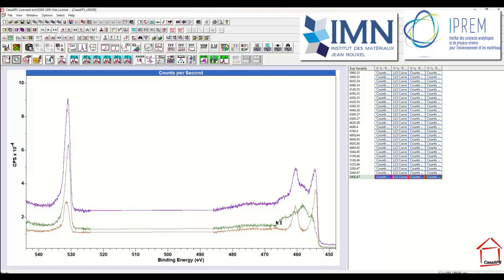We then have another state of the titanium that is correlated with a different amount of oxygen, and these two component spectra are enough to understand what's happening in terms of these two different phases as described by these component spectra.